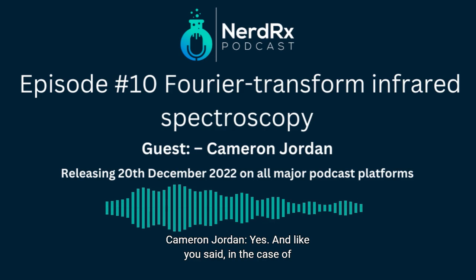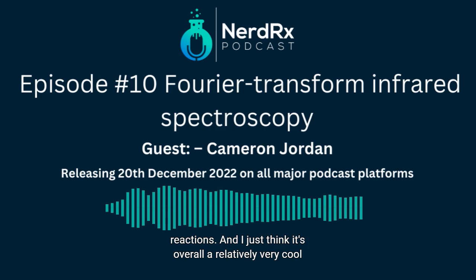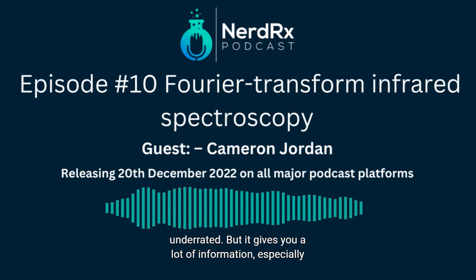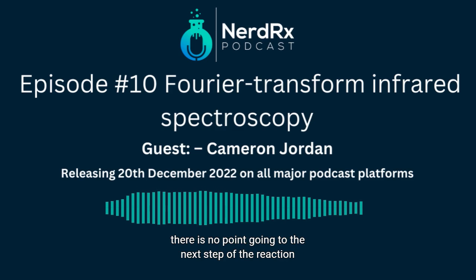Yes. And like you said, in the case of synthesis, you can use it to monitor the progress of organic reactions. Correct. And I just think it's overall a relatively very cool technique. Yeah. And I think it's really underrated, but it gives you a lot of information, especially for us in the context of monitoring our reactions. And it was great. If you don't see the carbonyl group, there's no point going to the next step of the reaction. Anyways.